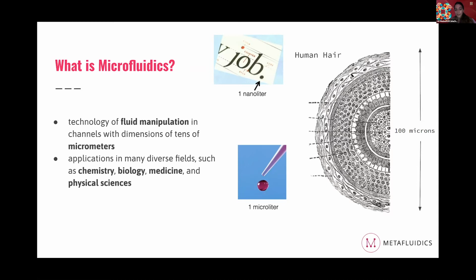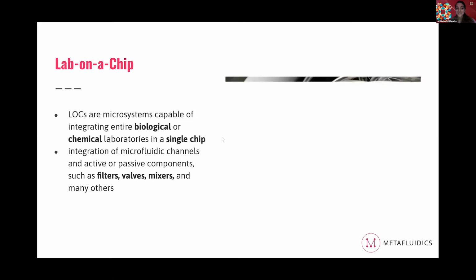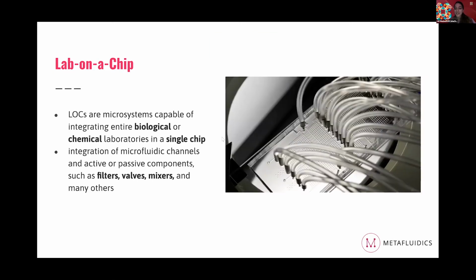Microfluidics has a lot of applications in diverse fields: chemistry, biology, medicine, physical sciences. Very versatile. Next slide. A lot of microfluidic systems are referred to as lab-on-a-chip systems, because they're able to integrate entire biological or chemical laboratories on a tiny chip, on a very small scale.